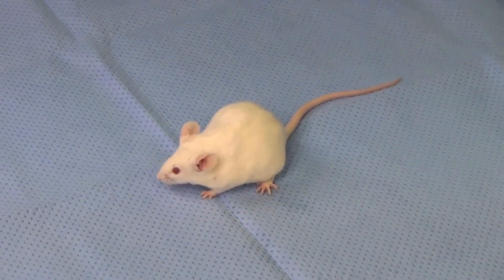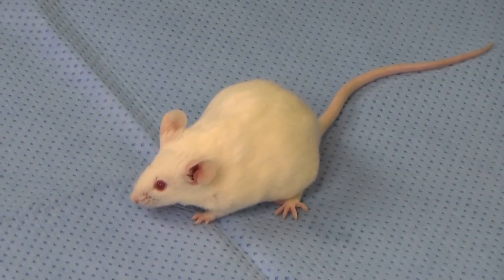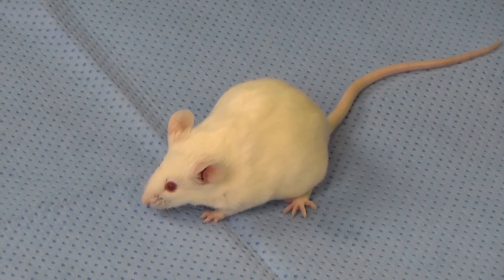Here we see that the mouse's respiratory rate, effort, and color are all within normal limits after restraint.